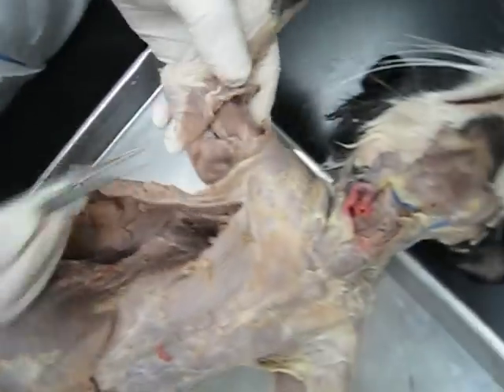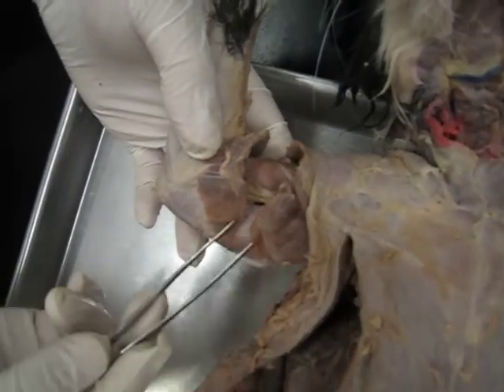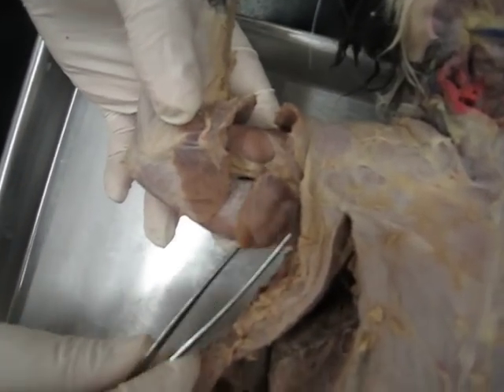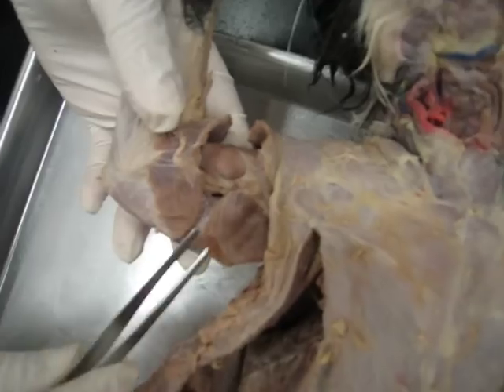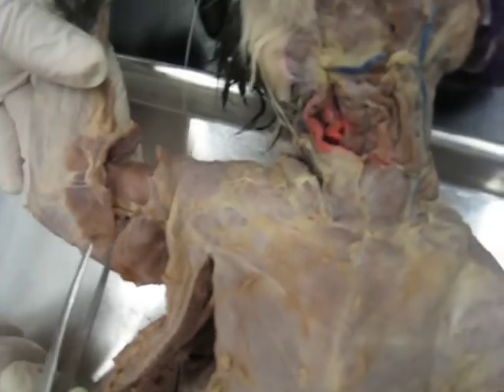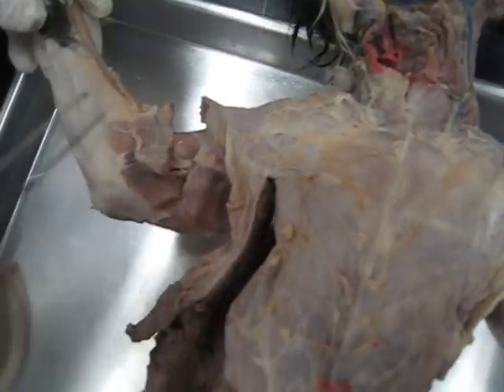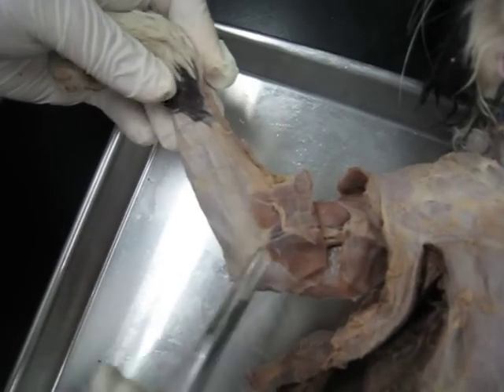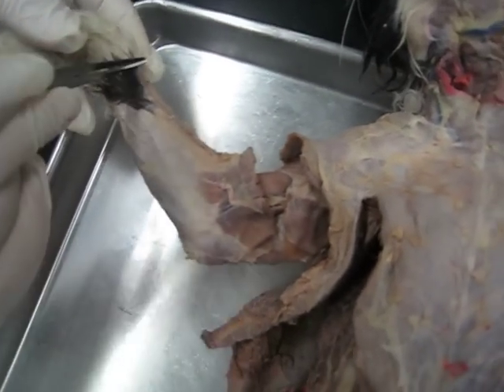From this view, this clavobrachialis muscle here — this is the epitrochlearis. Is that brachioradialis? Brachioradialis is actually inside here, so if you make an incision here, it's the muscle that's basically going from this point to this point.